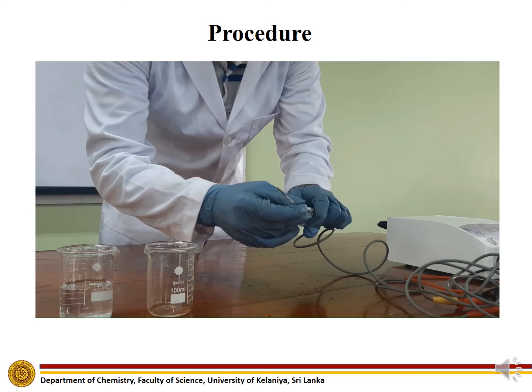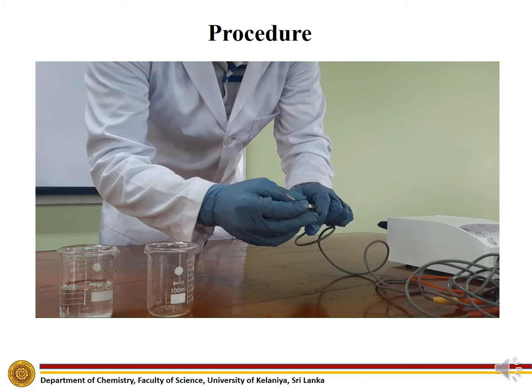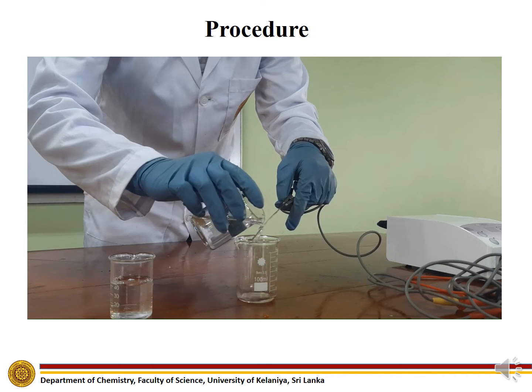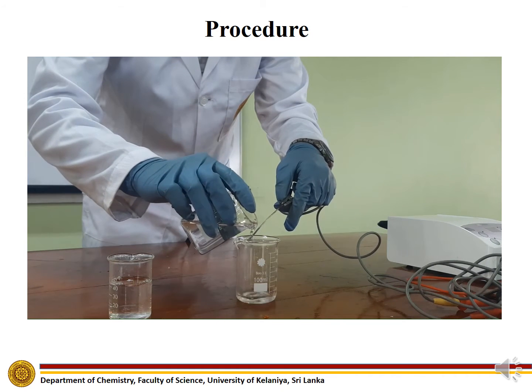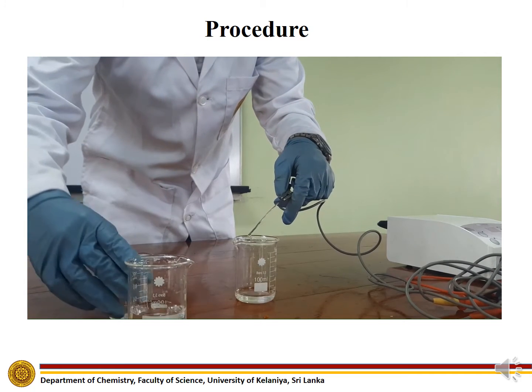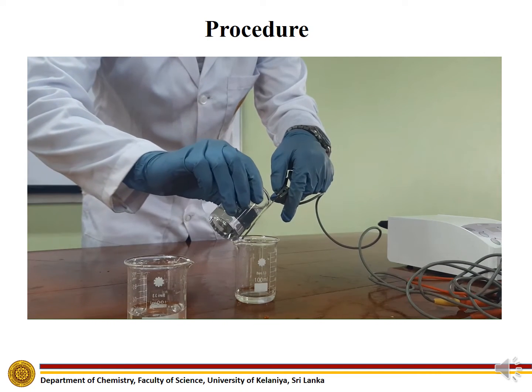Solder one end of the silver wire with a circuit wire. Wash the unsoldered end of the silver wire with concentrated nitric acid, then wash the silver wire with distilled water.